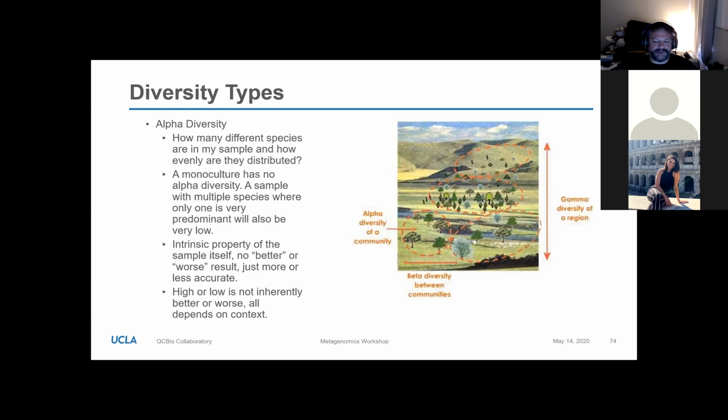So if you measure a vaginal microbiome and you find an extremely high alpha diversity, I've seen some people claim that getting a high alpha diversity is a sign of a better extraction. But if you get a high alpha diversity on a sample that is just inherently low alpha diversity, then you probably screwed up somewhere and you're detecting garbage. Alternatively, people operate under the assumption that stool should have high alpha diversity, but in fact, the alpha diversity is just a property of the stool sample. Different stool samples would be expected to have different alpha diversity.